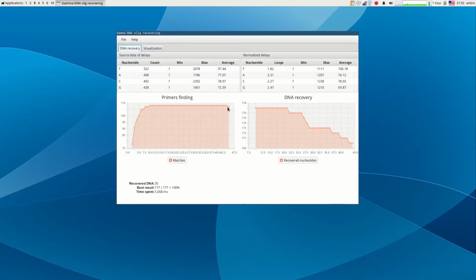Here, we determine the nucleotides in accordance with the threshold value and try to find the best entry of the primer in the resulting sequence. It can be seen that the best result is shown when the threshold values are from 10 to 44 inclusive. When the threshold value is 45, we see a descent. The search stops here because the next samples will show only a recession.